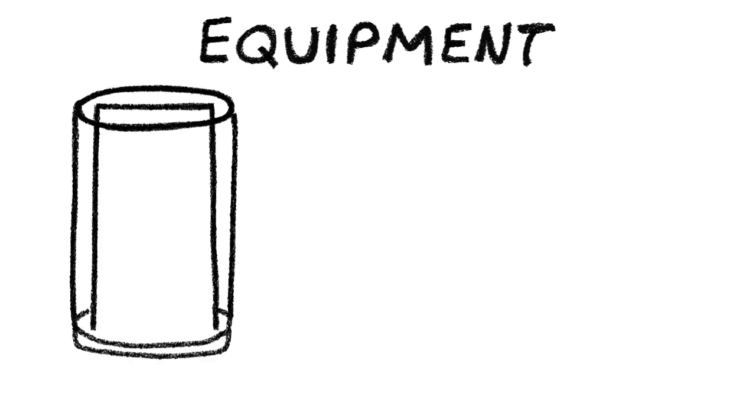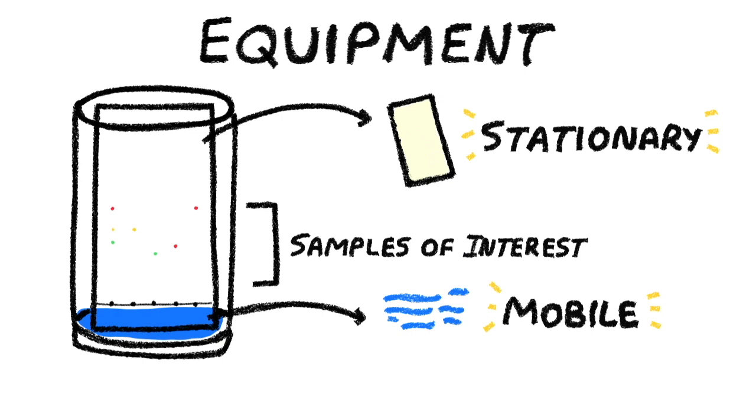TLC is not a complex technique to understand and conduct, but there are a lot of different factors that can affect the effectiveness of TLC. To start, we will discuss the equipment needed to conduct TLC. Shown here is the setup of what a TLC experiment would look like.